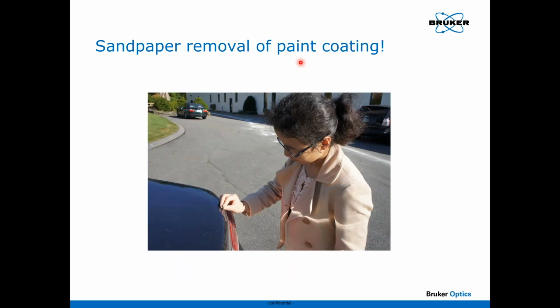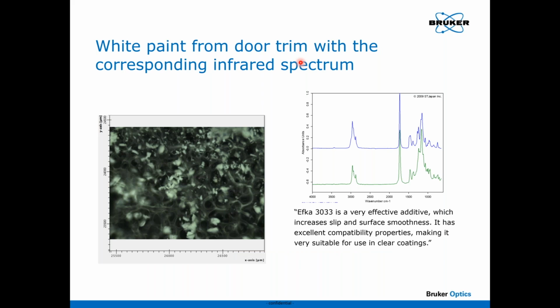And then there's my colleague Peng taking a few particles off my car. Yeah, she was authorized to do that. And you can't even see where she took the particles off. Now you can see the visible image after she had taken a few of those particles off, and you can see there's hardly any particles taken there.